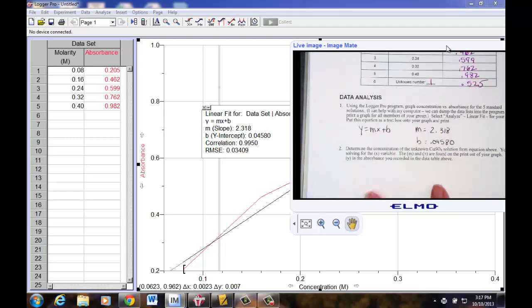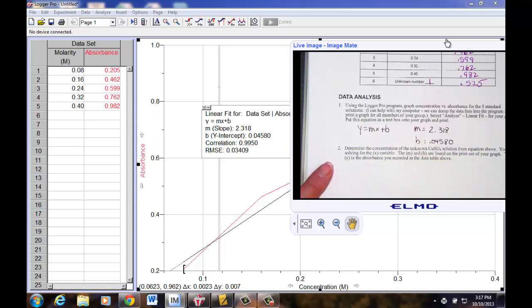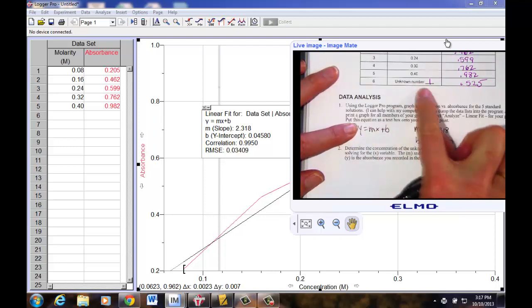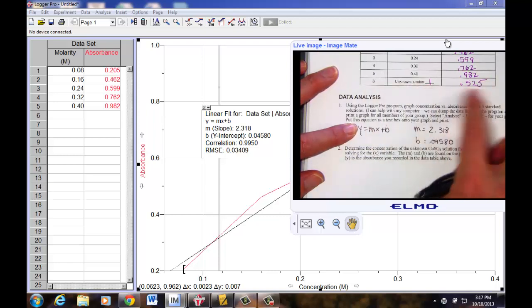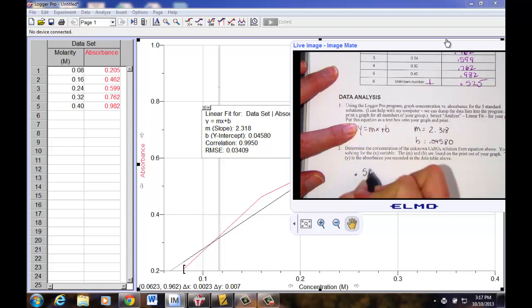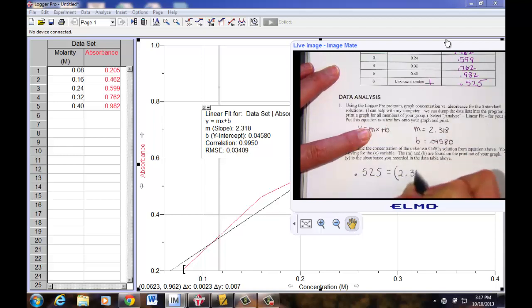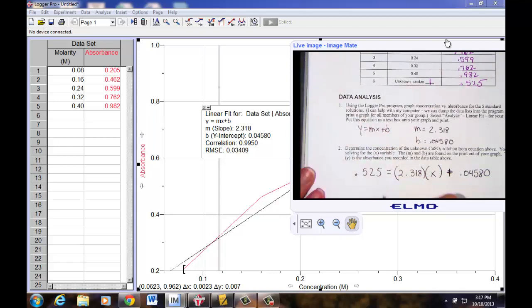So now with number two, it says determine the concentration of the unknown of your copper sulfate solution from the equation above. You'll be solving for the X variable where the M and the B are provided from right up here on our graph. So use your Y as the absorbance. So this Y, the absorbance of the unknown for my made up data, it's trial six, the unknown. What was the absorbance? Well, mine was 0.525. The M value, again, just pulling from here, 2.318. I'm solving for X. X is our molarity unit. X is the X axis there in molarity. Plus 0.04580 plus the Y intercept. So Y equals MX plus B. Let's solve for X.